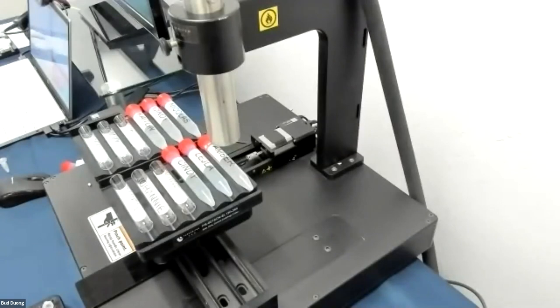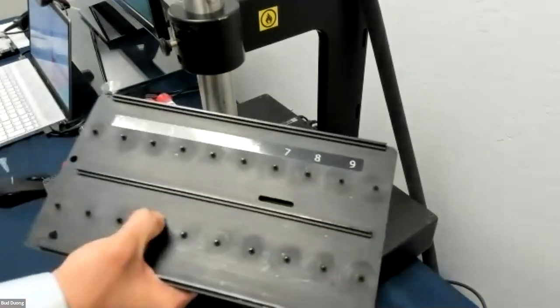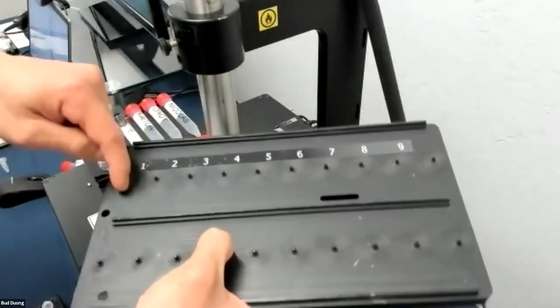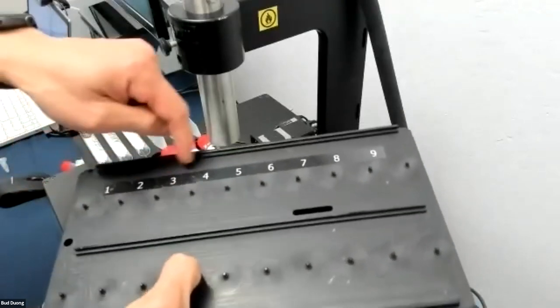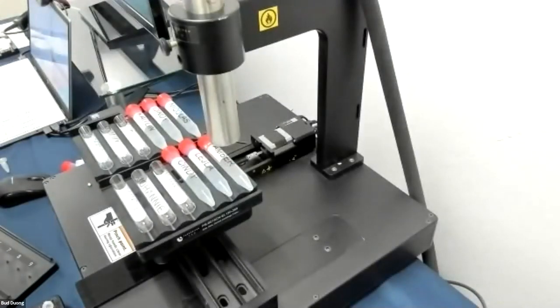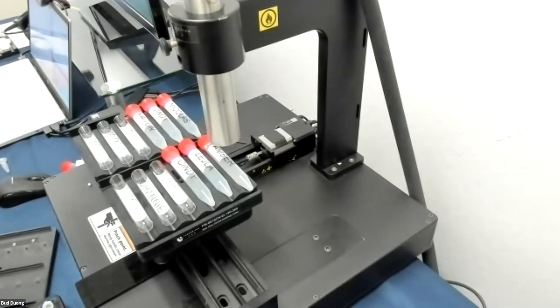One more question: can you use it on a slide? Absolutely. Here's the adapter for the slide — the slides sit in each slot. And I can imagine the next question might be, can you print on a histology cassette? Those often go hand in hand, so let me show you the adapter for that as well.